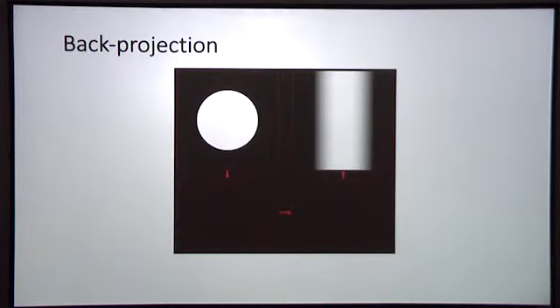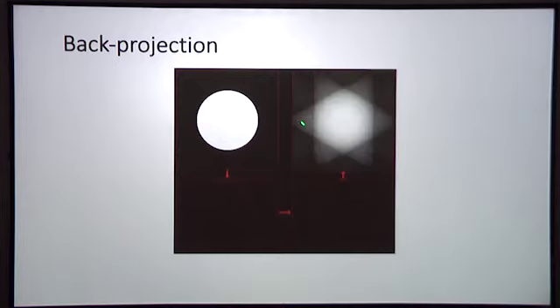There's another way of explaining the same thing. We're doing a 2D version, so we have a disk, we project in this direction, that is the projection, so it's a 1D projection, and we can then back project to generate the volume again. That's the result if we have a single image. In this case, if we have 3 images, we end up with something that looks closer to our object, and as we add in more images, we end up with a better representation. It's not a perfect representation.